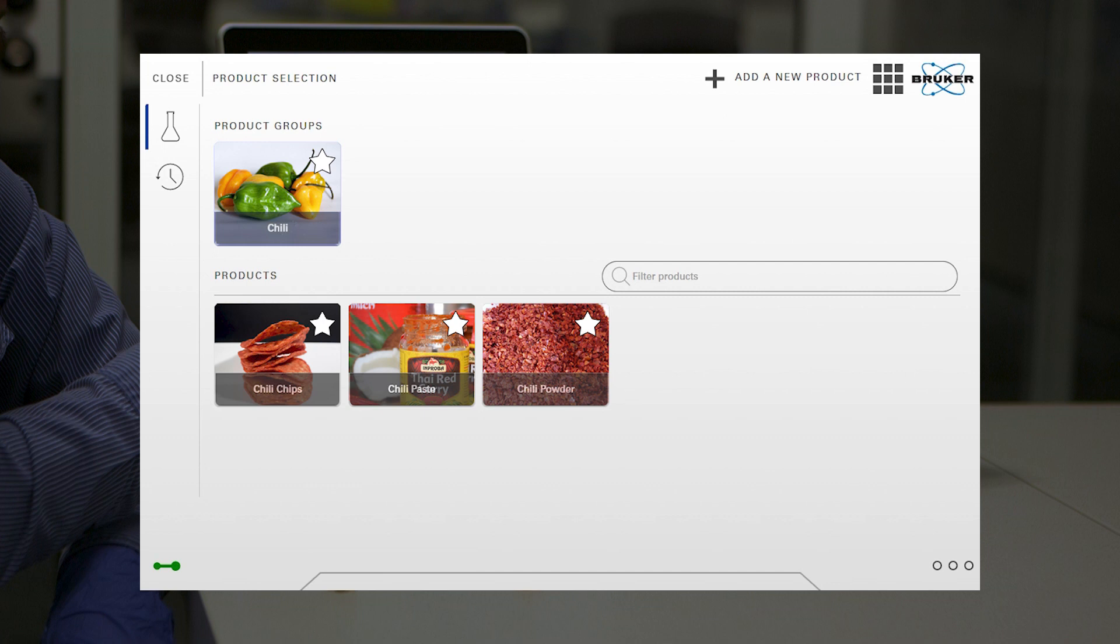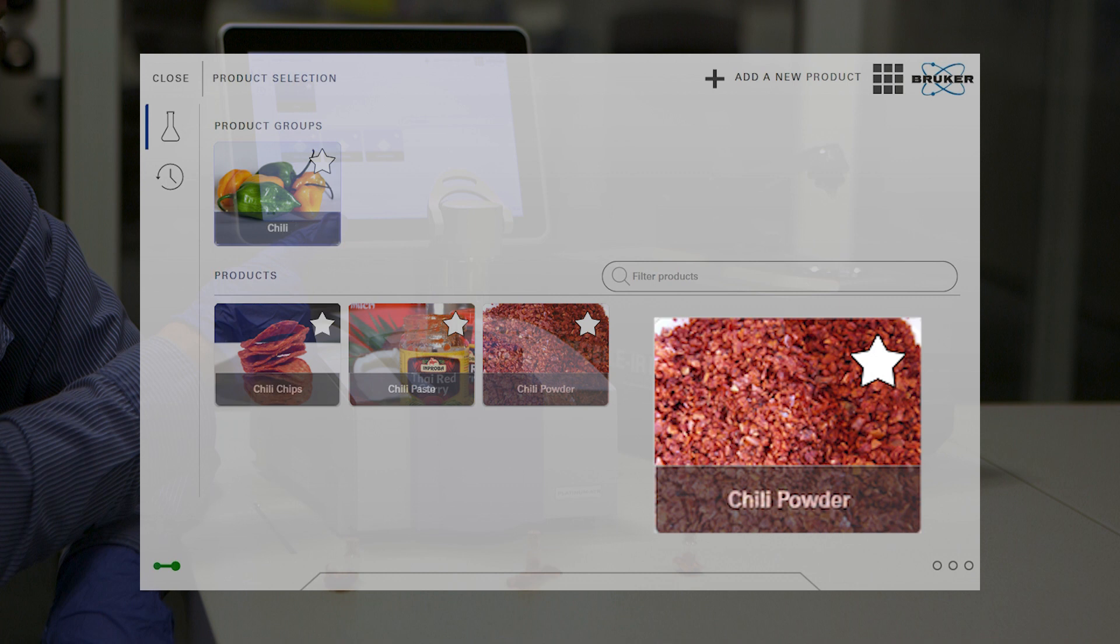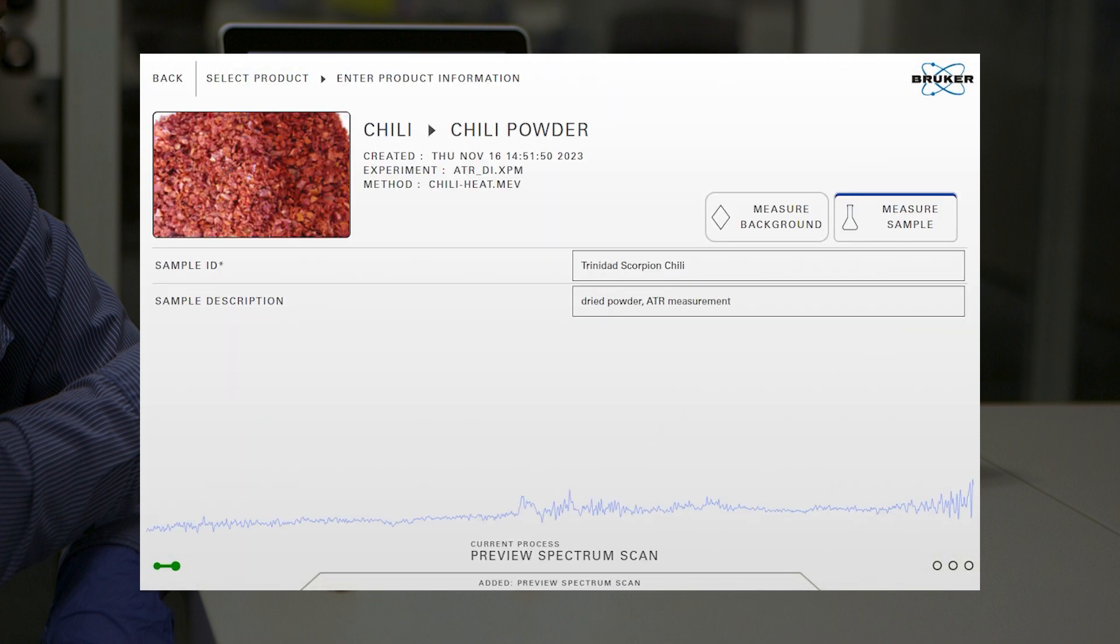We select the product we want to test in Opus Touch, in our case chili powder. Such product-specific workflows combine multiple related methods into a nice push-button analysis.